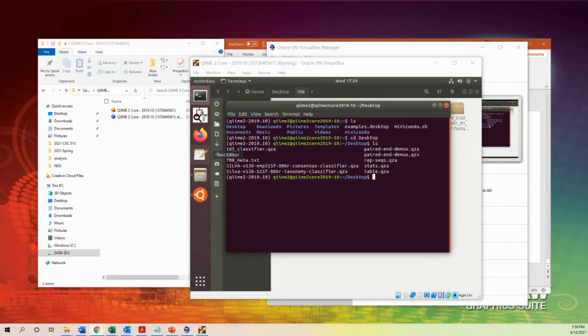Professor, I have dropped the files. Yeah, drag the FASTQ files, H1 till H4, 8 files.